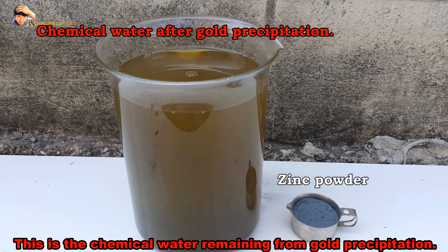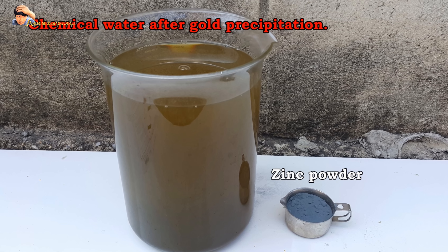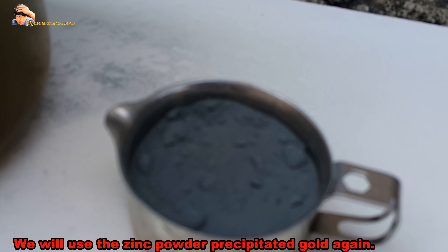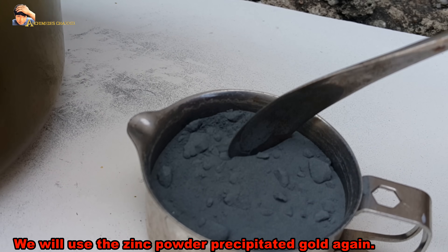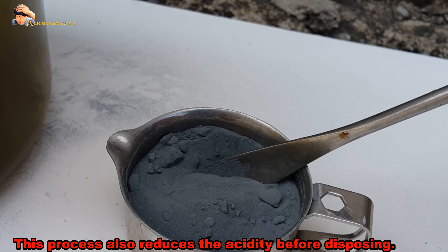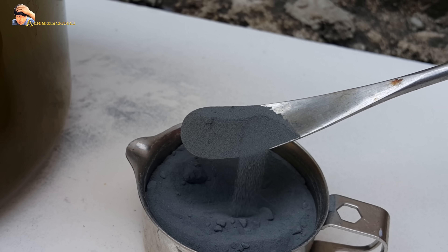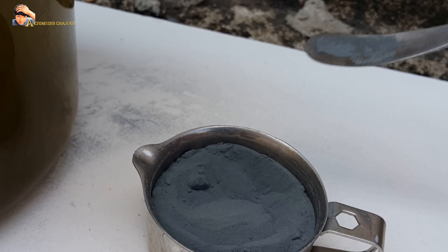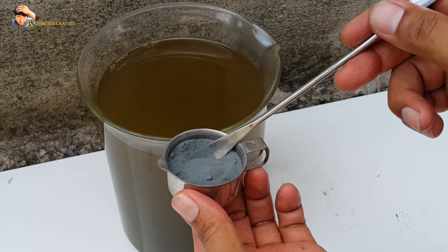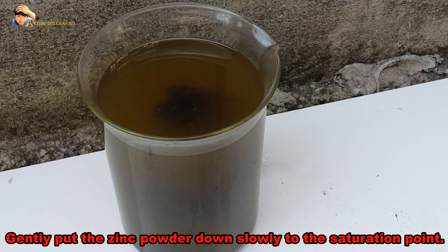This is the chemical water remaining from gold precipitation. We will use zinc powder to precipitate the gold again. This process also reduces the acidity before disposing. Gently put the zinc powder down slowly to the saturation point.